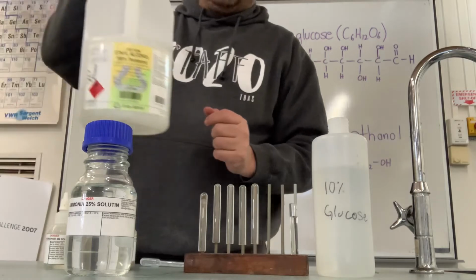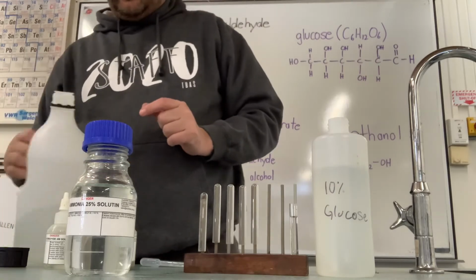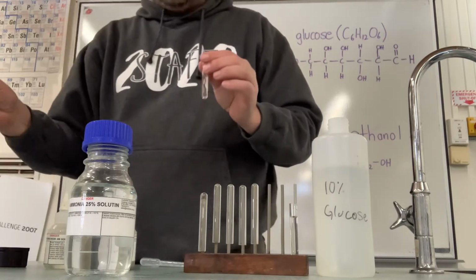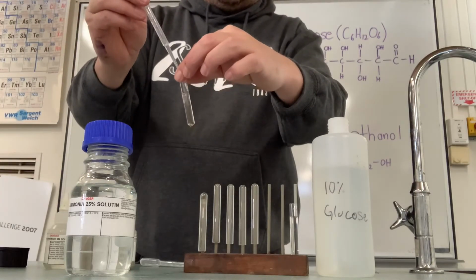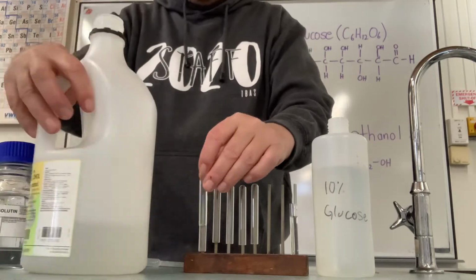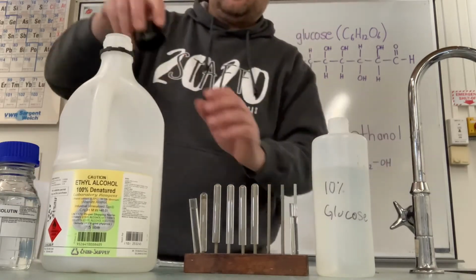And then I've also just got some ethanol here, ethyl alcohol, ethanol solution, which is just a normal alcohol. So I'm going to add some of that to the other solution. So just a clean pipette here. We'll add that to the ammoniacal silver nitrate. And let's just put that one down to this side. Put them at the end next to each other so that we can remember which is which.